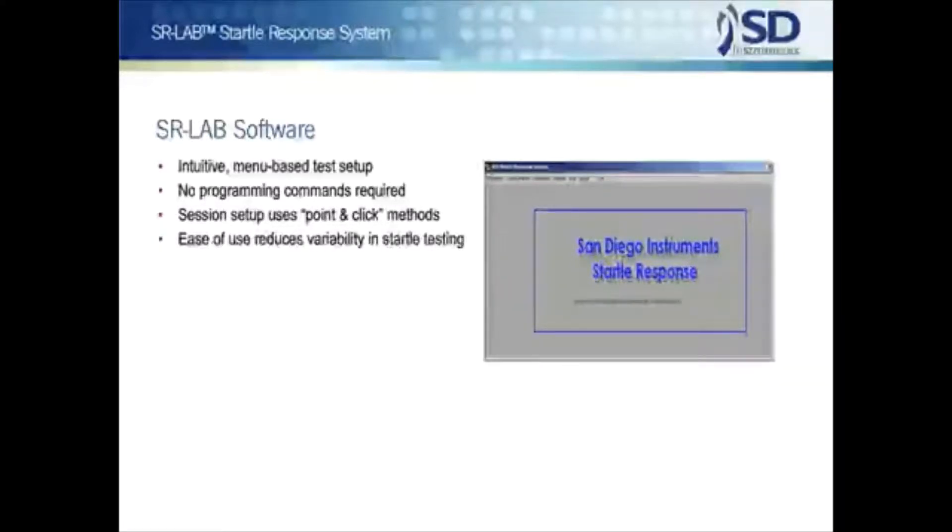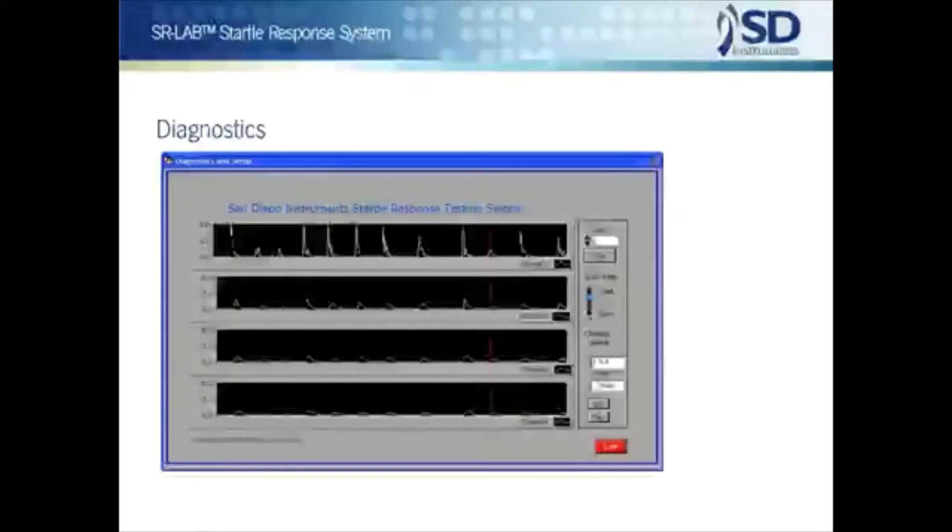For both user groups, the careful design and production of the SR Lab hardware and software are aimed at the goal of reducing variability in test results to an absolute minimum. The SR Lab provides essential pre-test diagnostic routines for the examination of both response and stimulus operations. Although there are self-tests in the system, these routines are not just passive checks — the user can actively manipulate stimulus and response components and observe the effects. For example, the user might tap or vibrate the animal chamber and see the result on an oscilloscope display.